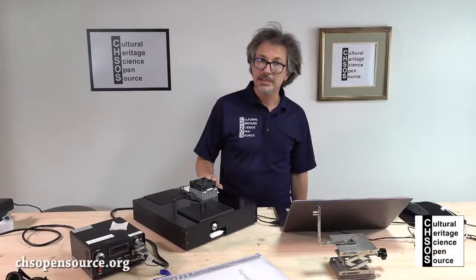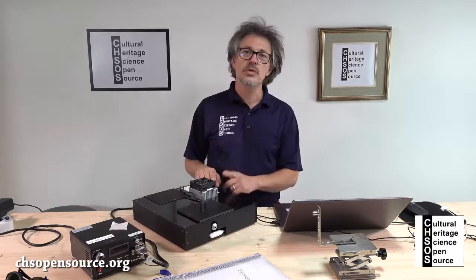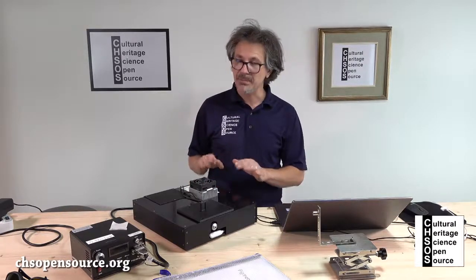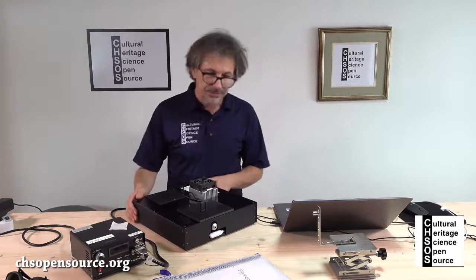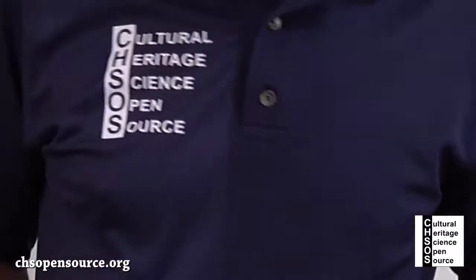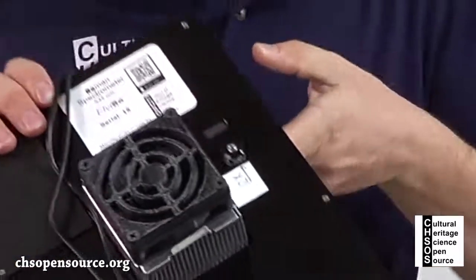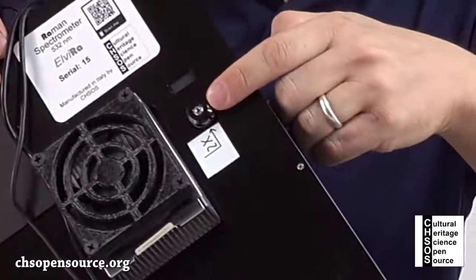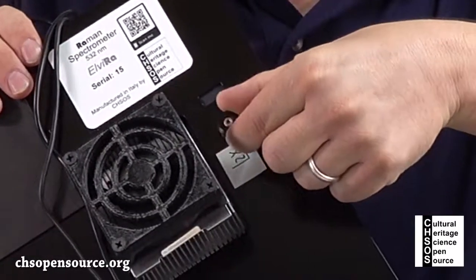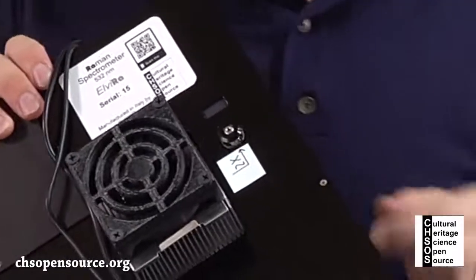In this lesson, we're going to discuss another option we have on the spectrometer, on the setup of the spectrometer. Over here, on the top, okay, let's put the spectrometer like this. We have this knob over here. I can turn this knob left and right, clockwise and anti-clockwise.